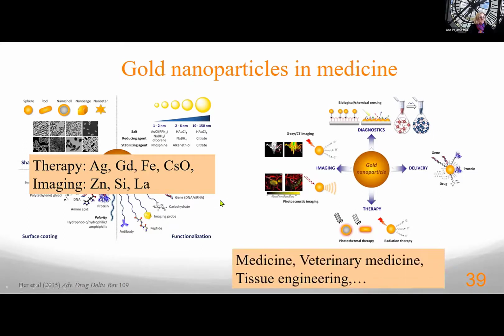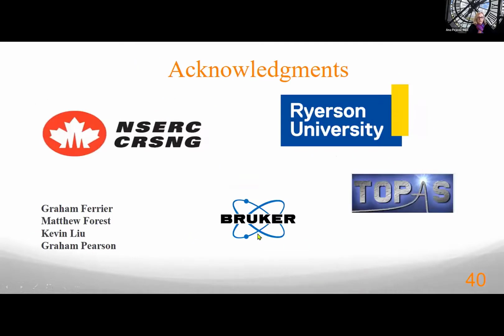This also means that nanoparticles are not only used in human medicine. There is quite a large body of research in veterinary medicine, and also one that I personally think is very interesting within tissue engineering, which further expands the use of TXRF and shows how it can be very, very beneficial for different research areas.